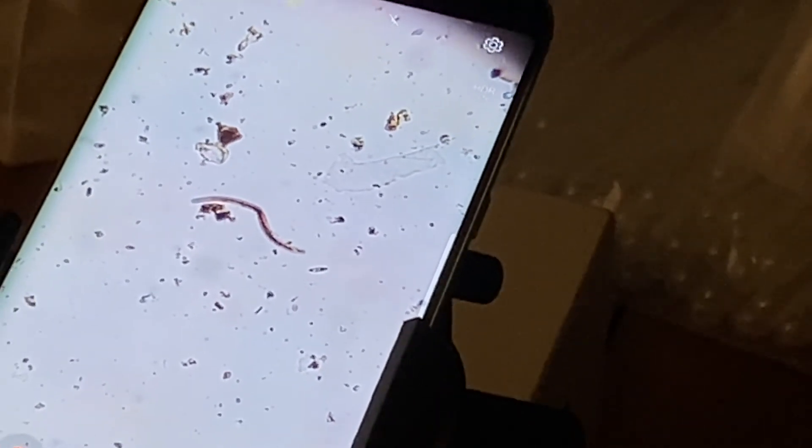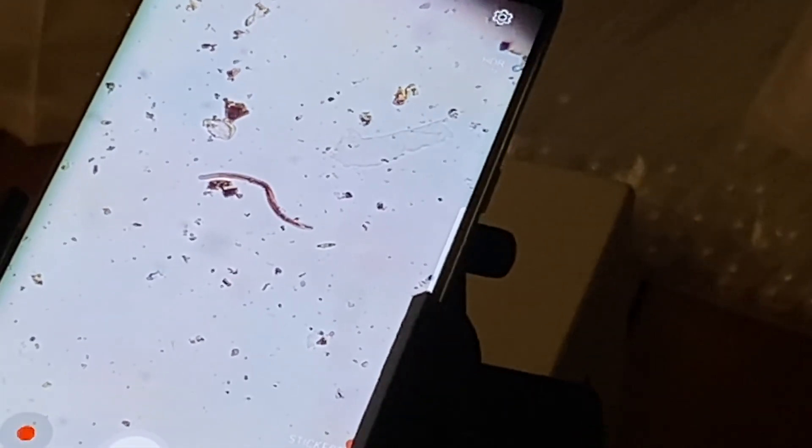Nematodes are also a part of the soil food web, so we just want lots of diversity. There's one type of bad nematode that'll feed on the roots, but they have a very distinguished retractable needle that you can see, and that's not one of them. So everything else is usually a beneficial nematode. They can eat bacteria and pathogens and make what's in the bacteria available to plants. Nematodes are very important for your soil health.